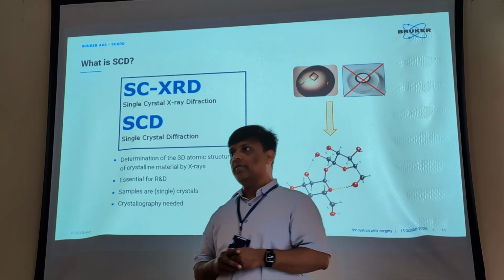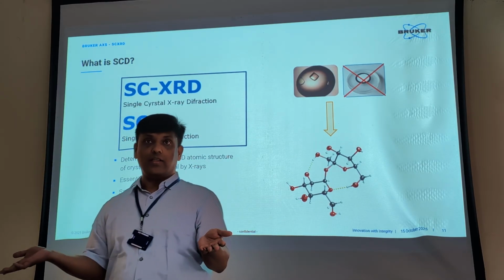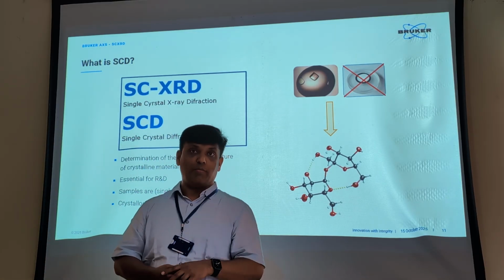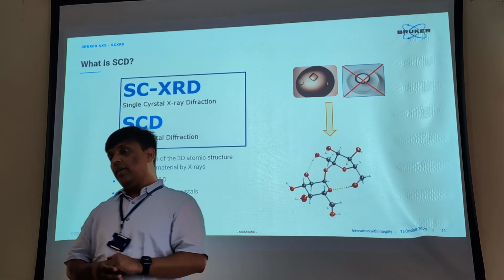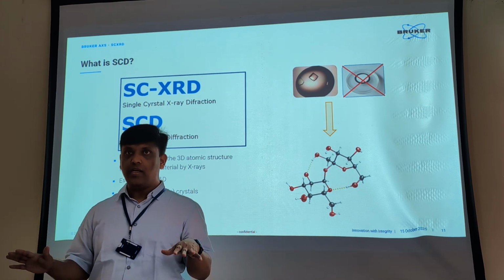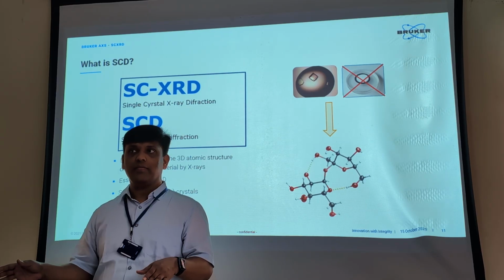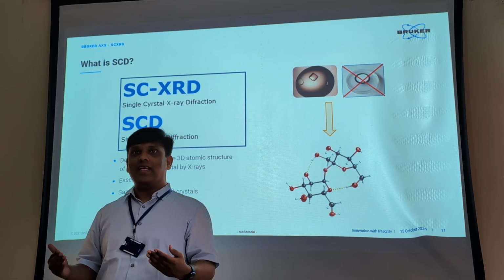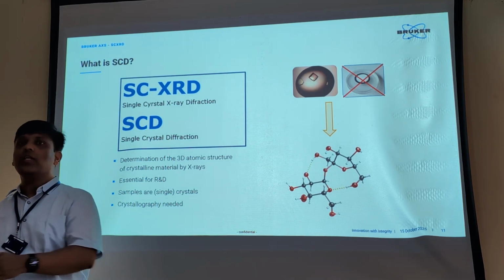Then the obvious question, particularly for this institute, because you do not have a powder X-ray diffractometer: you can ask me, yours is also a single crystal X-ray diffractometer, so why can't you do powder material? Here, this machine is dedicated to single crystal analysis, but it doesn't mean it will stop you there. You can do some powder samples as well, but you cannot make a real comparison between the results obtained by a regular XRD and a single crystal XRD.